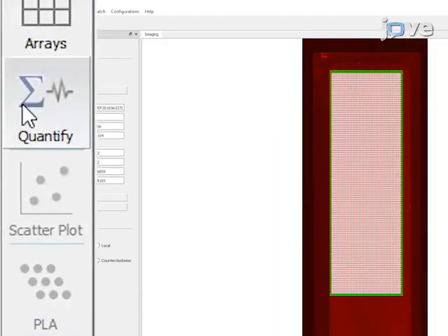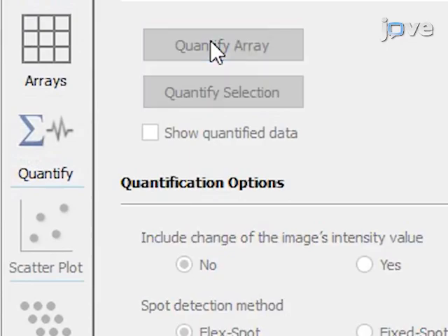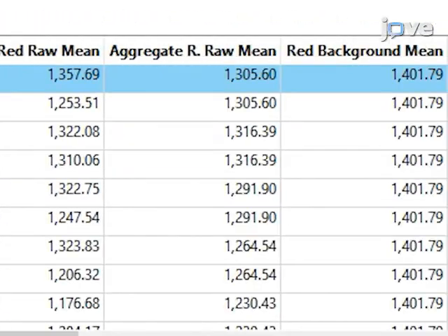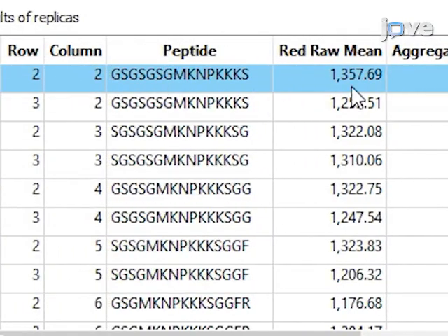Select quantify selection in the specific software, which creates a readout file that contains the signal intensity for each spot, the background value, and the corresponding peptide sequence.